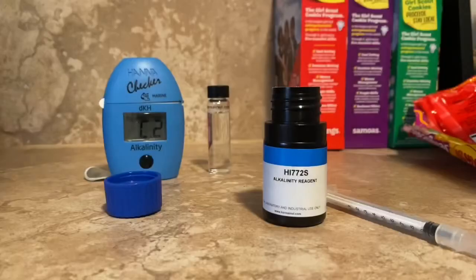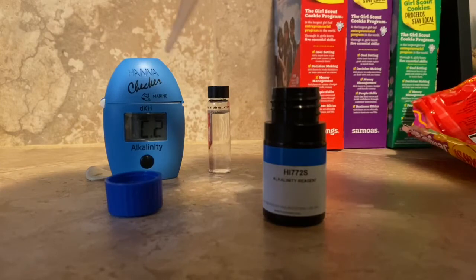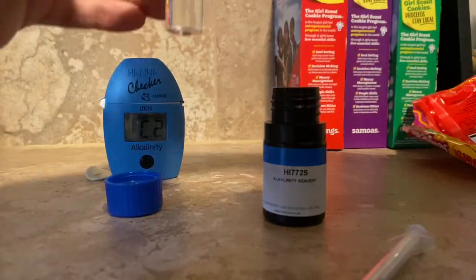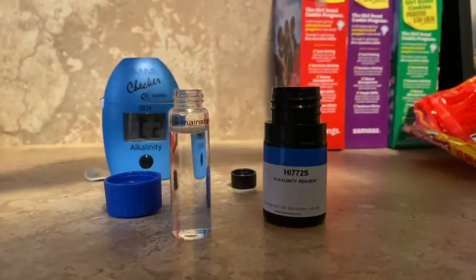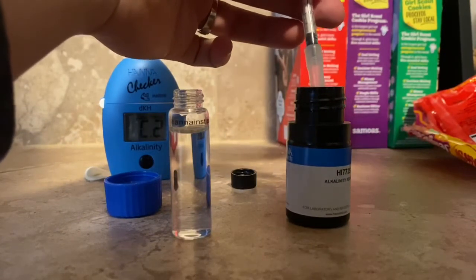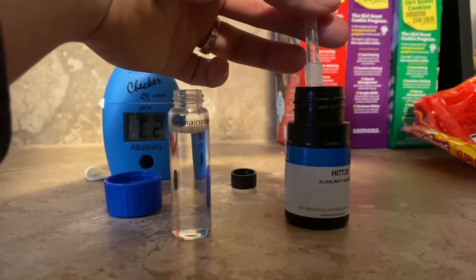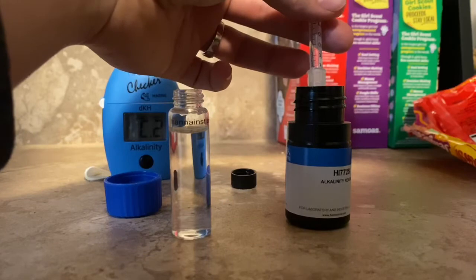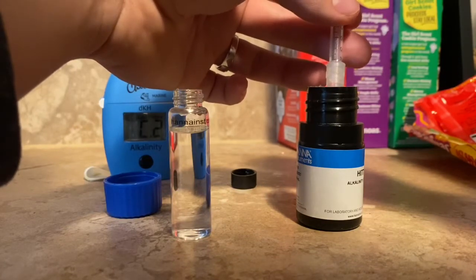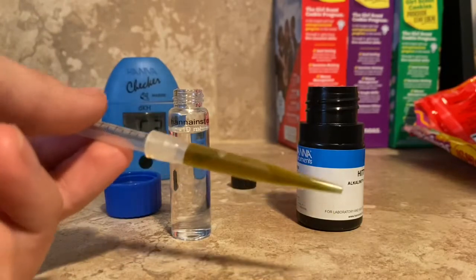Here is the reagent vial. Make sure the tip is completely submerged, then draw up that one milliliter. It might be easier to overshoot a little and then push the plunger back in until you reach one milliliter. All of the liquid should stay in that plastic tip. Make sure you take the lid off the vial first — that will make it a little easier. And there we have our one milliliter of reagent, all contained in the tip.